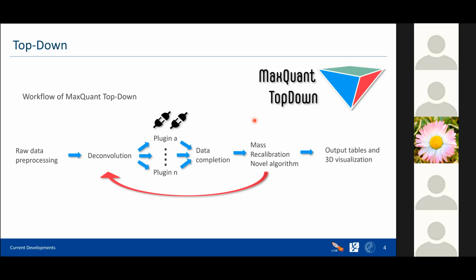And then what we do in bottom-up proteomics is recalibration by the first search, and only after that you can do the second search. We won't do that exactly the same, but we are going to do some kind of recalibration. For that, we develop our own new algorithm, so it's not going to be the same as the first search. And then, of course, we have to do the search over again, in the second step where the mass was then recalibrated, basically the same.